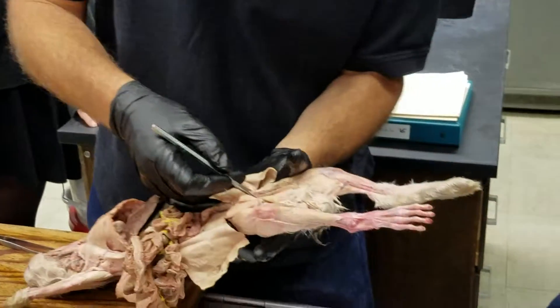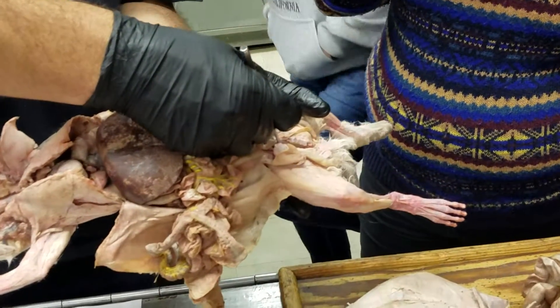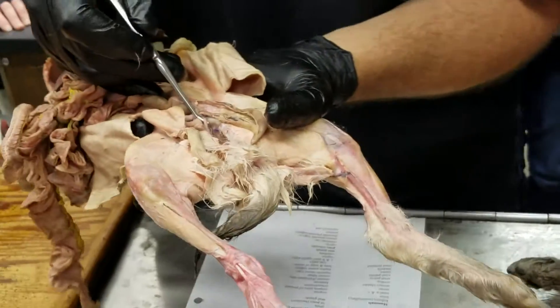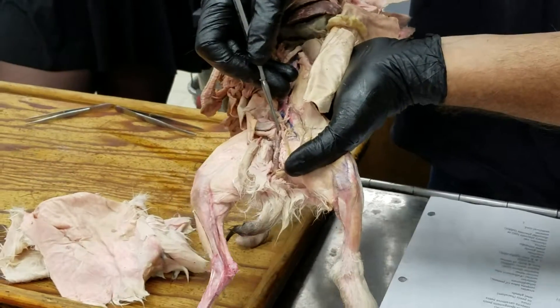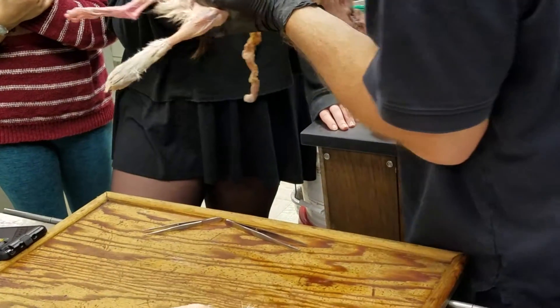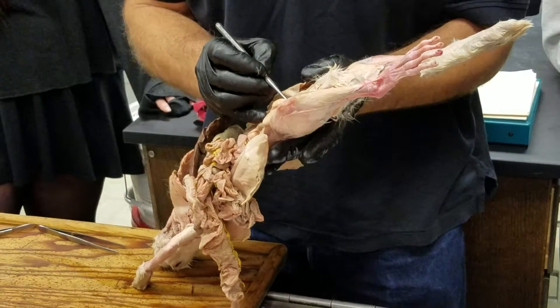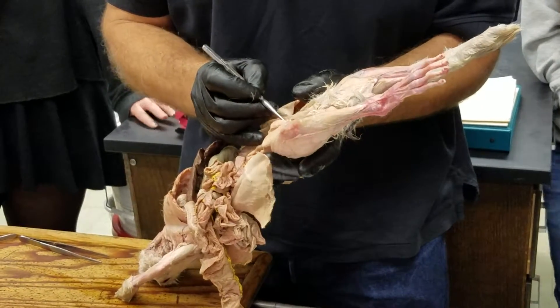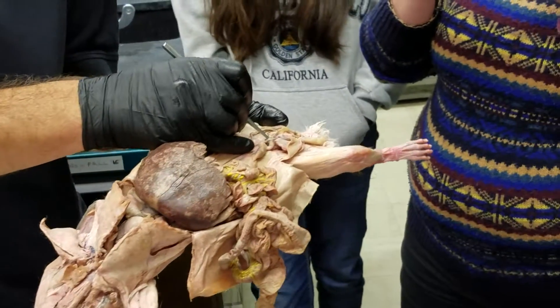You can see the ductus deferens coming down behind the urethra, one on either side. They actually unite and then join with the urethra. Right behind the ductus deferens is a gland that also empties into the urethra — that's the vesicular gland, which secretes a component of the semen.